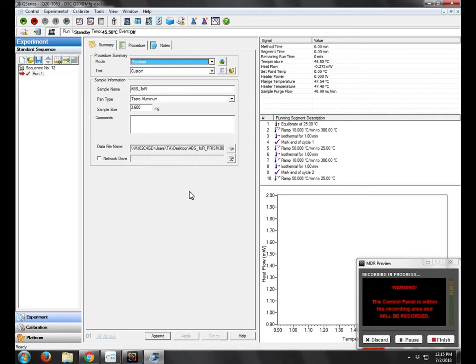Okay, so we just turned on the nitrogen tank. It's running through a dryer as well, so it's dry nitrogen.